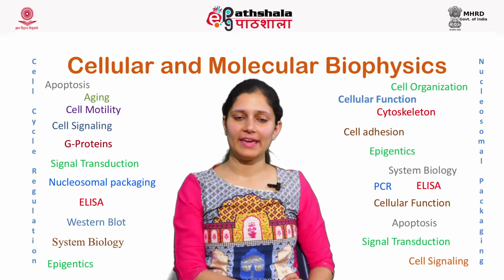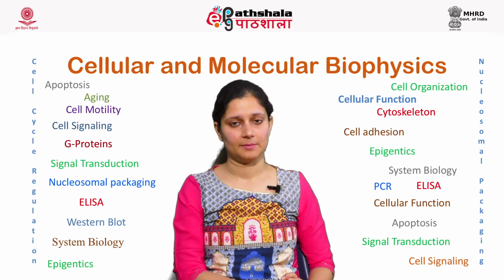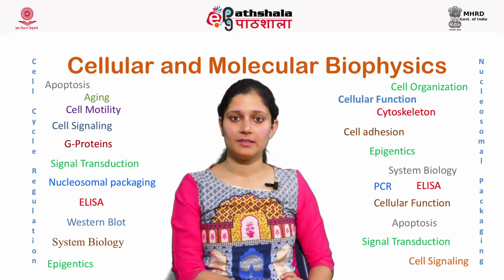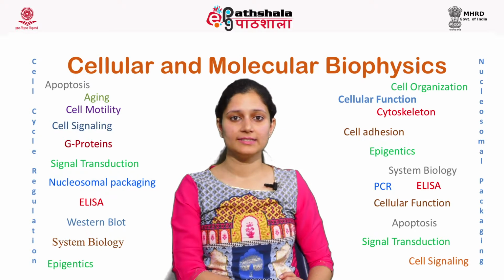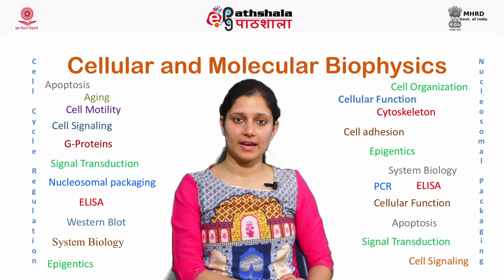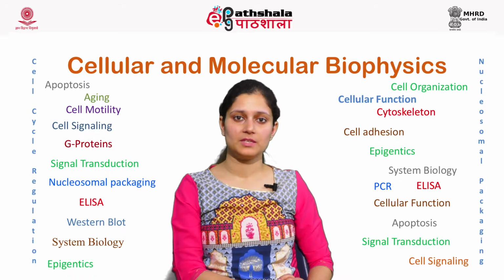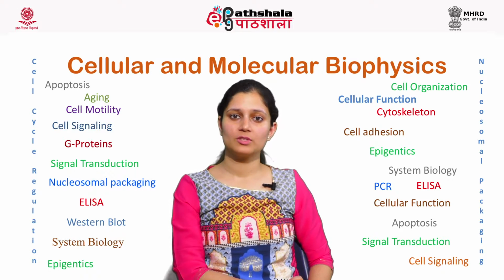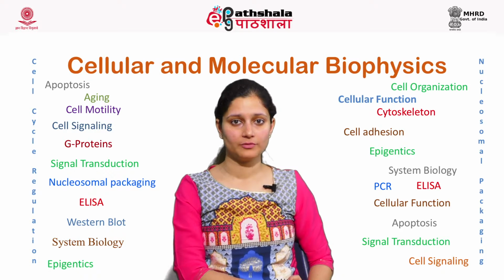Conventional PCR is an end-point assay. However, real-time PCR measures the PCR product formed in real time. That is, measurement is done after each cycle of the PCR. In real-time PCR, the amount of DNA produced after each cycle can be quantitated using a double-stranded DNA dye which binds only to double-stranded DNA. When the double-stranded DNA dye binds to double-stranded DNA, it emits a fluorescence which can be captured by the real-time PCR machine. We can also use oligonucleotide probes which can hybridize to the target DNA and give a fluorescence signal which can be detected after each cycle of the PCR.